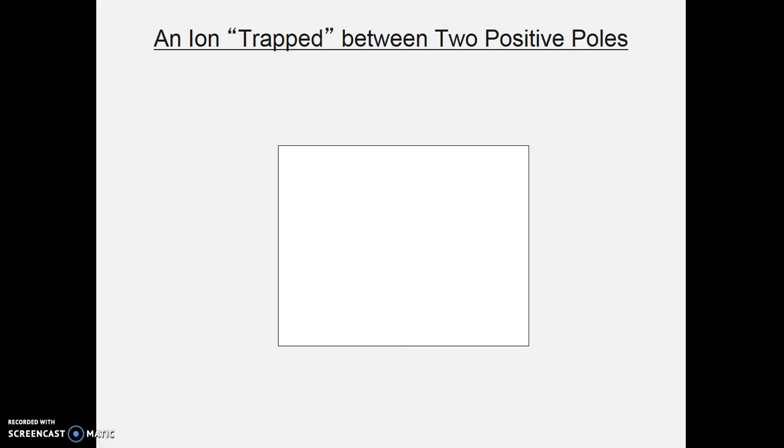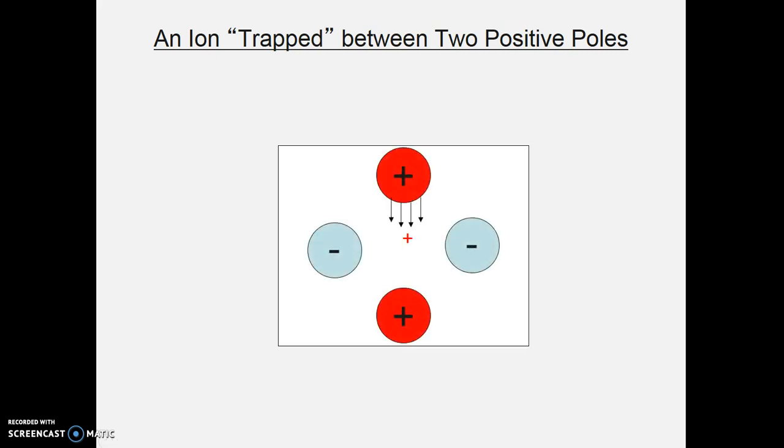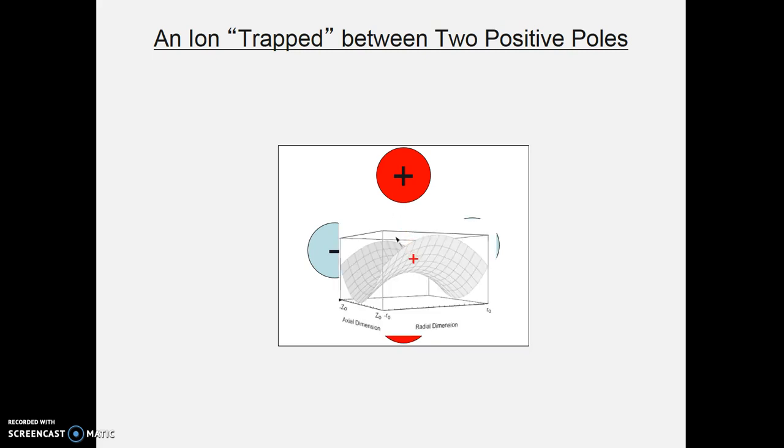And so what does this do in a simple sense? So here's how our normal experiment will go. You feel the field, you're a positive ion. Oh, feeling the field, you've got to bounce back over there. But you get there and, oh my gosh, you're feeling that field too. Now this is the simplistic view. And you're an ion in this potential. Really, you're going to kind of roll down it.